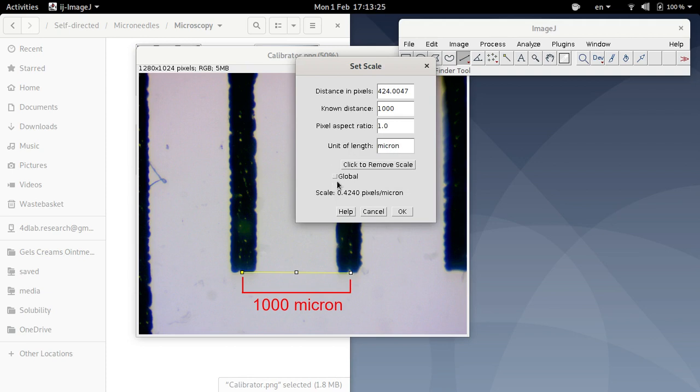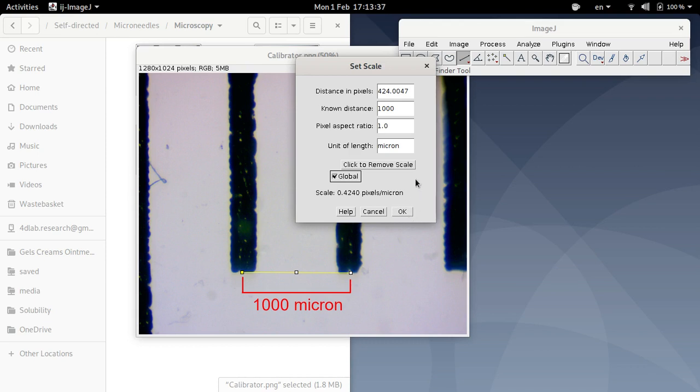Okay, I will click that global. I will click that box. And what that does is it makes ImageJ remember this conversion factor so that if you then close this image and open up other images, ImageJ will apply the same scaling factor to those images as well.